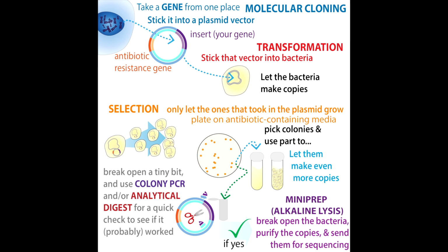And what you're going to do is take your pipette tip and dip it in the colony, and then stick it in a tube with about 5 milliliters of the LB broth, which is the same thing that you made with the plates, but here you don't have the agar. So you're growing it in suspension. So you grow it in these tubes, let the bacteria multiply and multiply, and basically the goal of that part is just to get lots and lots of copies of that single clone. And now what you want to do is get those copies out.